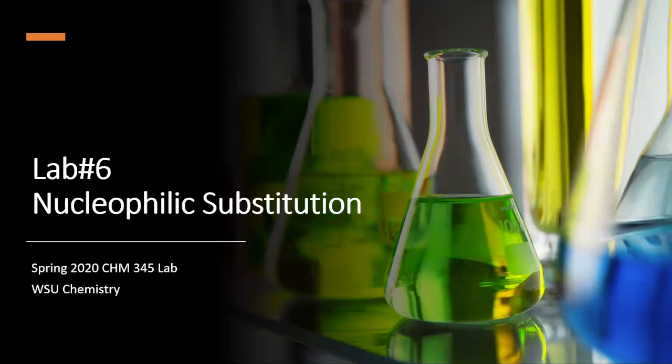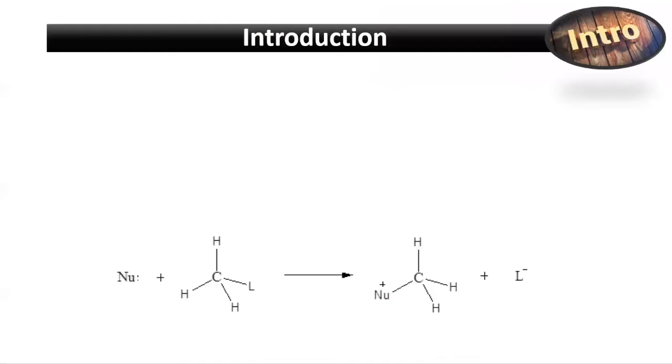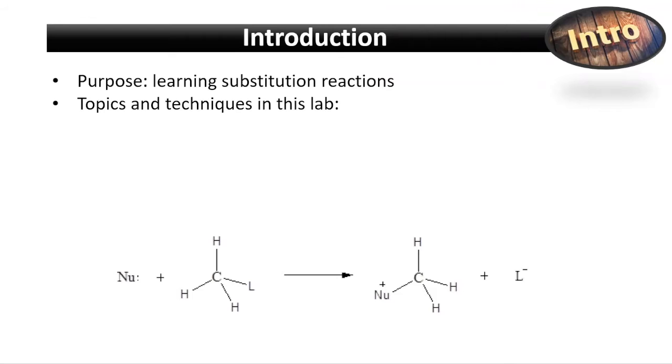Hello. Today we will be discussing Lab 6, Nucleophilic Substitution. The purpose of this lab is to learn substitution reactions, and some topics and techniques discussed in this lab include reflux condensation and substitution reactions.